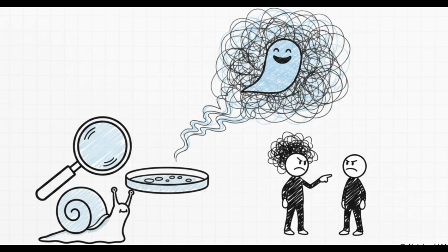Traditional root cause frameworks often just default to blaming humans, because let's face it, we're the easiest target statistically. And yes, while personnel shedding skin is a huge factor, over-attributing events to human error can completely mask the real underlying issues. Routine air change calculations don't reveal unintended recirculation paths or stagnant air pockets created by localized heat sources. Plus, traditional culture-based sampling takes 24 to 72 hours for colonies to grow, which severely delays detection.